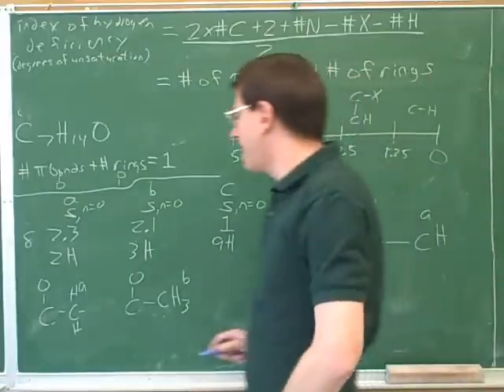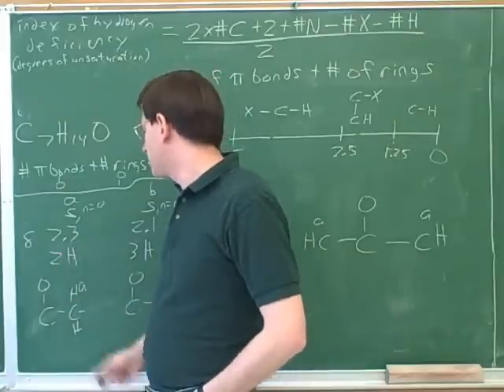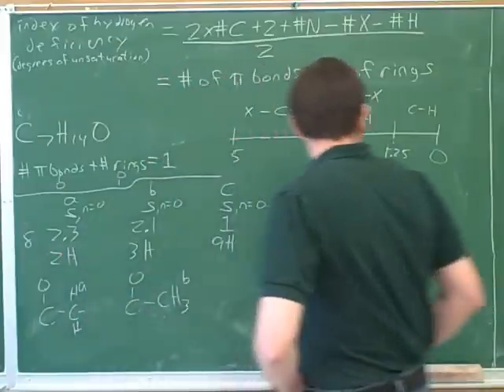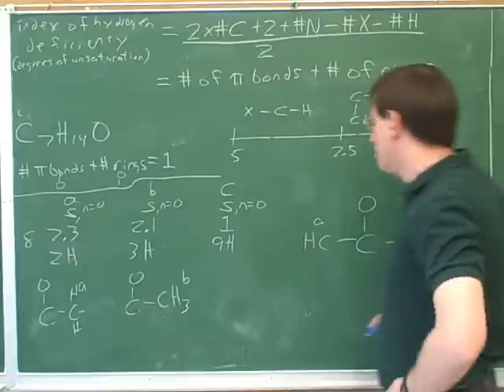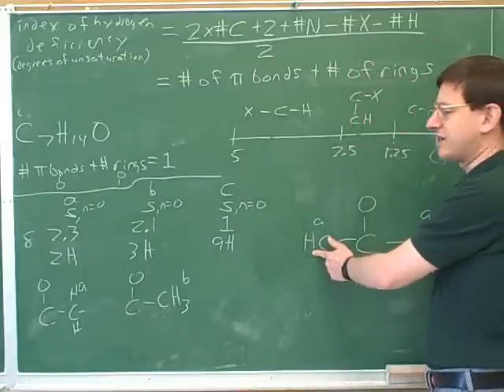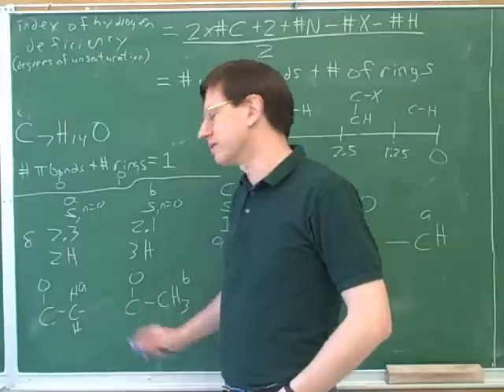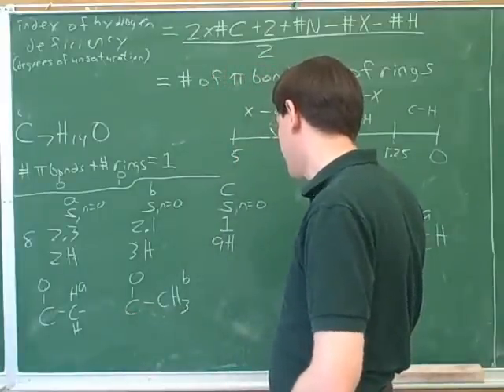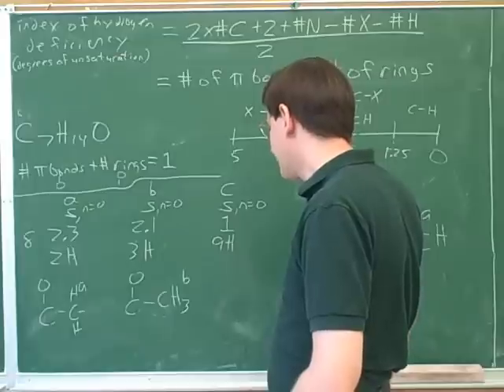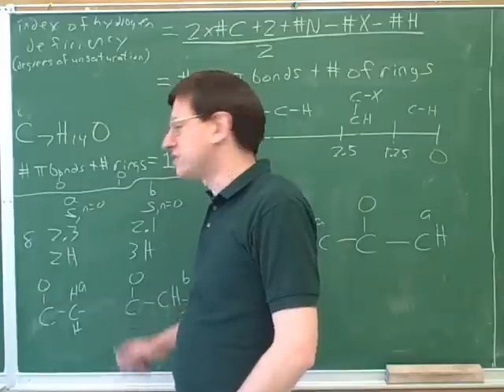Earlier we didn't really know what group A was. We weren't sure whether group A was two hydrogens on the same carbon or a single hydrogen on separate adjacent carbons. But this actually now we can rule out. This is not going to be working because there wouldn't be enough room then for this group on this carbon. Well, that's not really true, actually. This could have two other bonds, so I guess that still is possible.